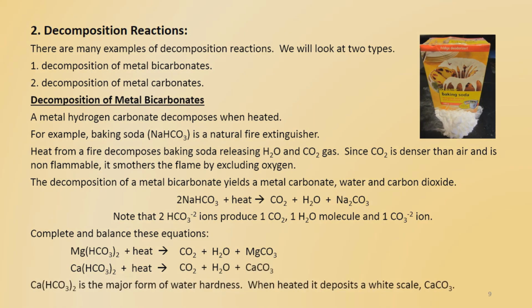Calcium bicarbonate is the major form of water hardness. When heated, it deposits as a white scale. And you might see this in the bottom of a kettle, and we see it industrially in boilers.